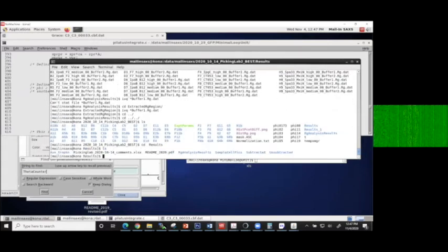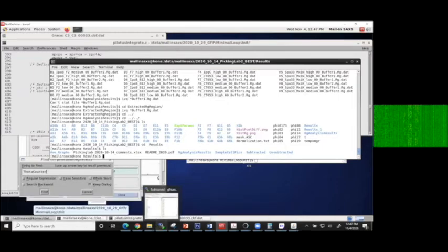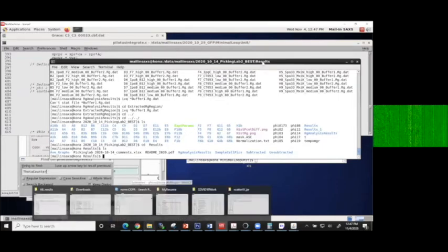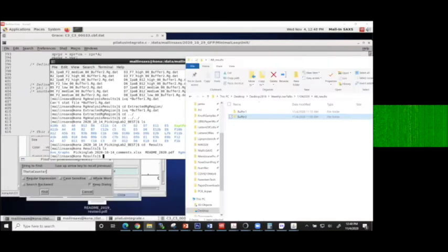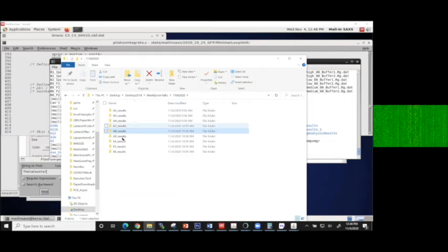So let's go through some data here. Once you have an idea of what we collected for you, you can start pulling it down to your PC or your Mac or whatever. And hopefully you guys know how to do that. And I've already done that for some curves here. I've done that for this set. So protein 1 is A7 through 9. Protein 2 is E4 through E6. And the complex is in the beginning. Okay.